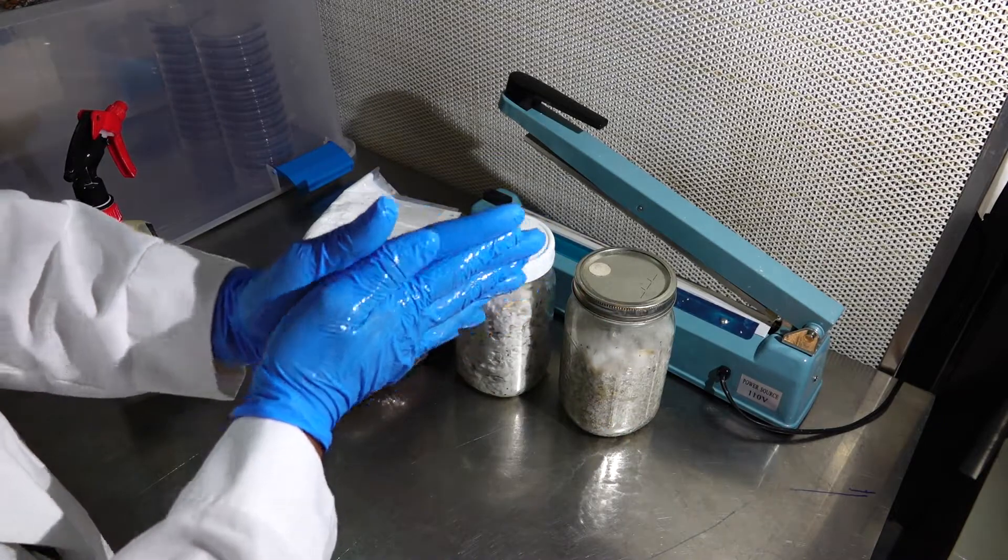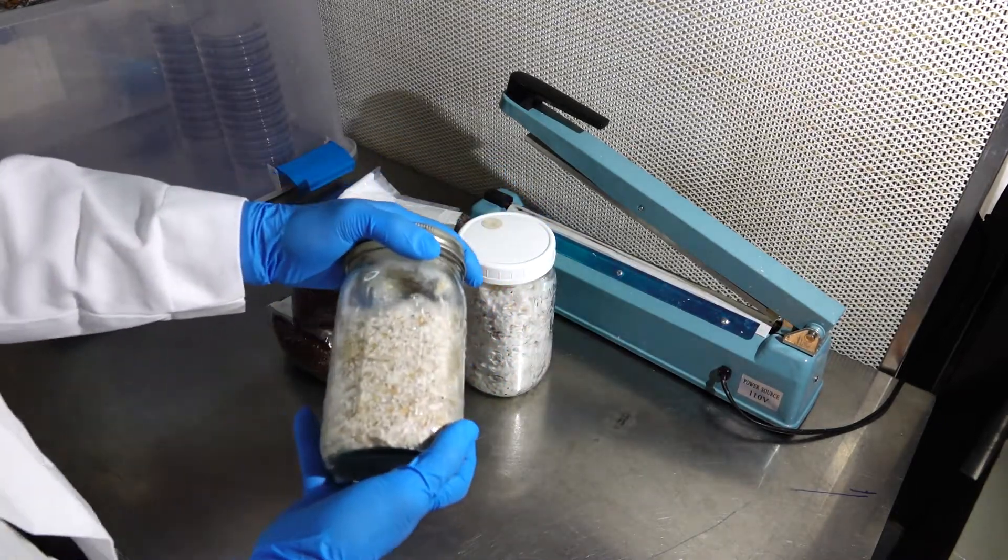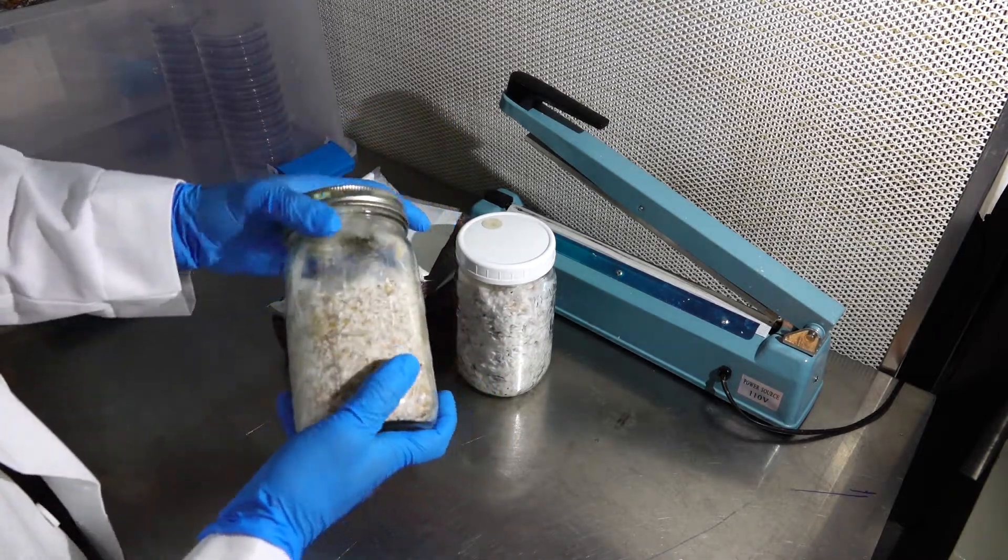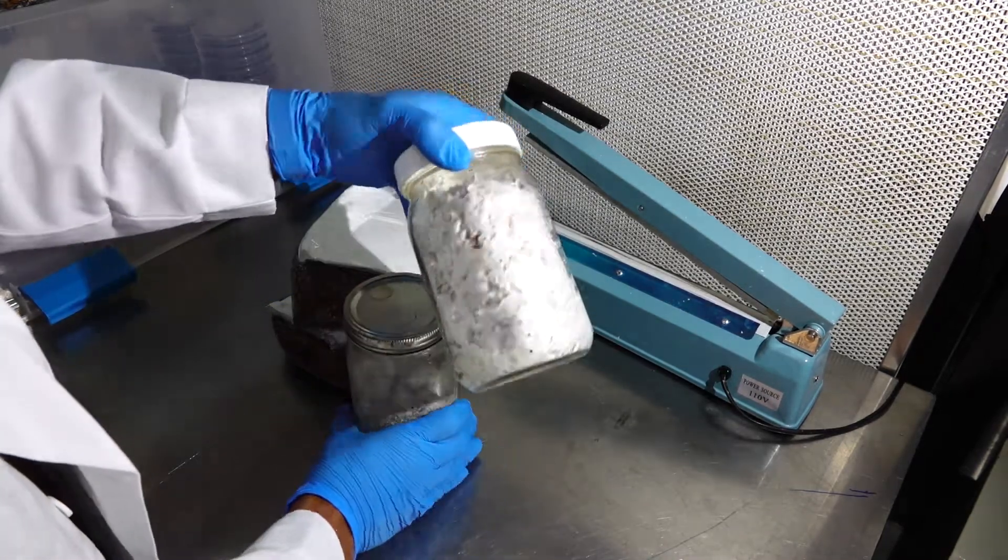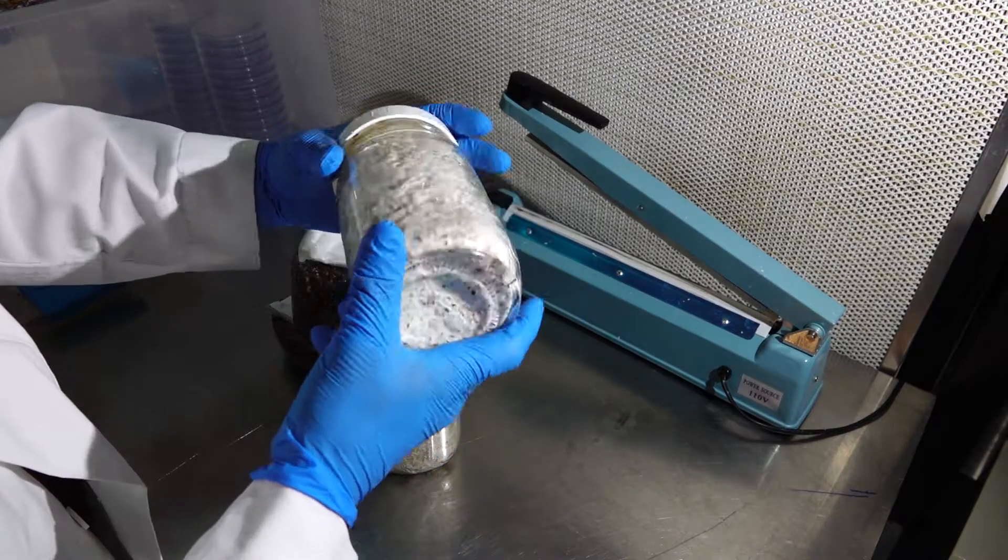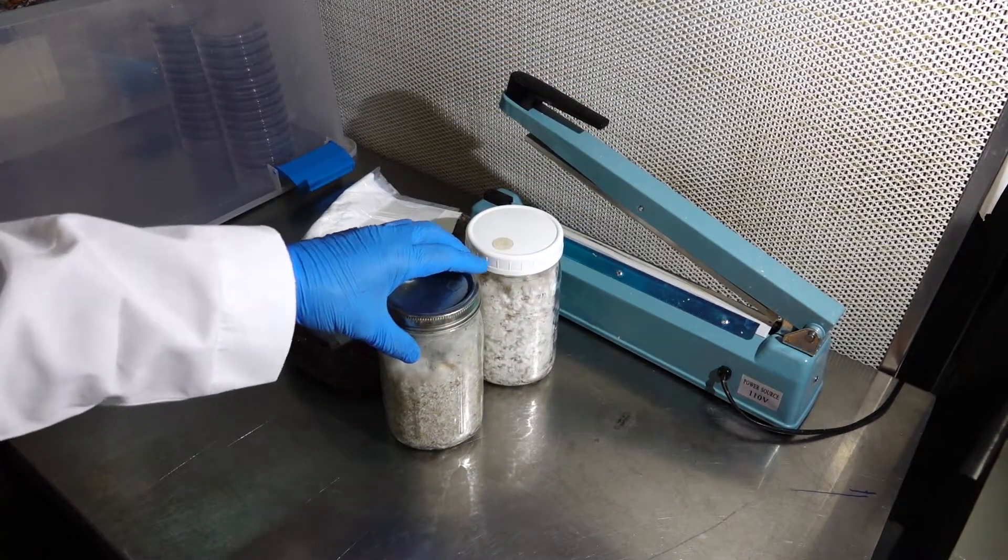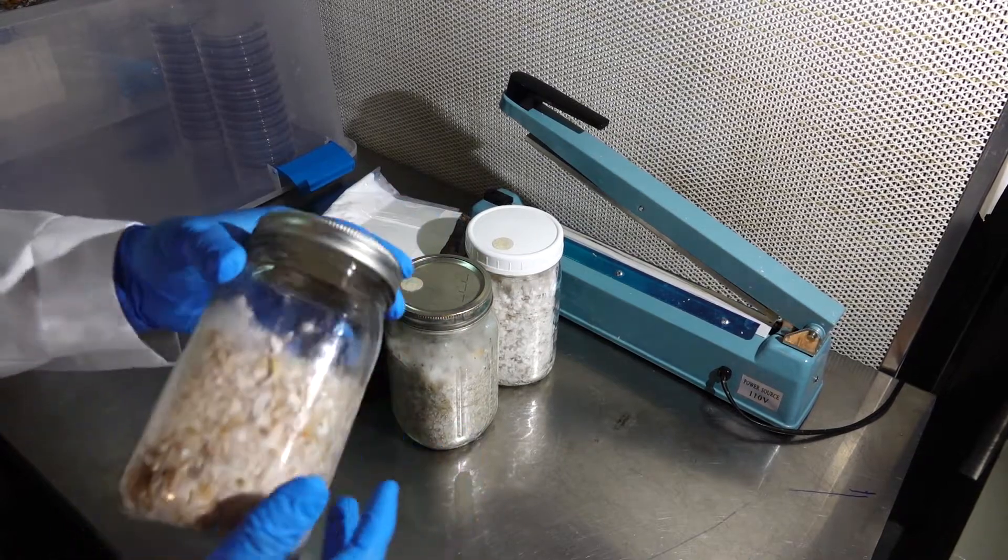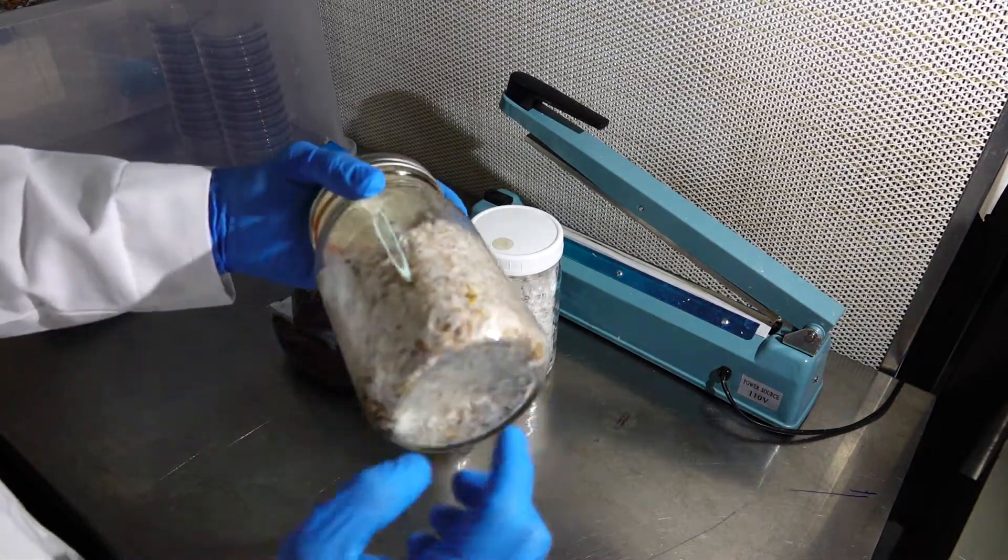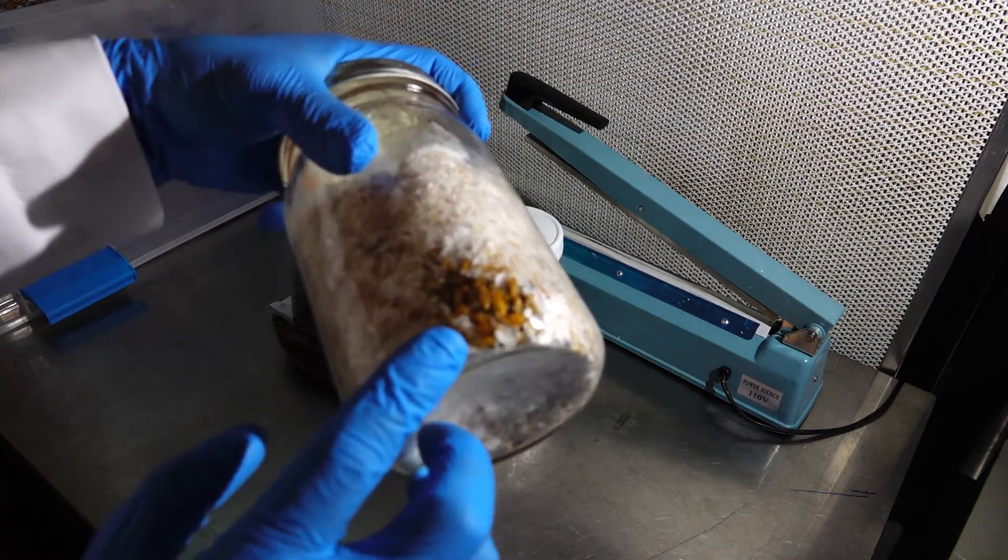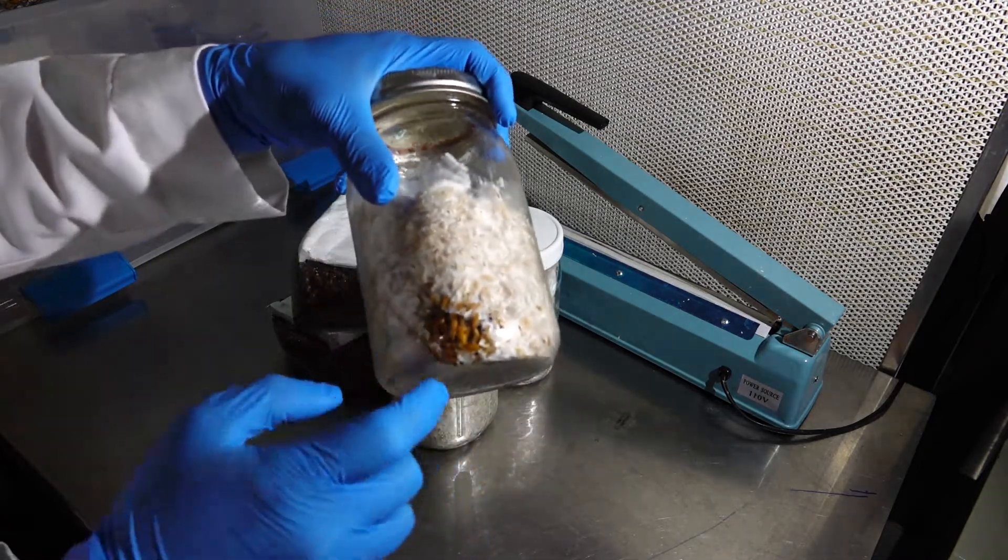The first thing you're gonna want to do is have a fully colonized jar. When I say fully colonized, I mean fully colonized. You want your jar to be 100% white. You want to make sure that all of your mycelium has attached itself to the grain.